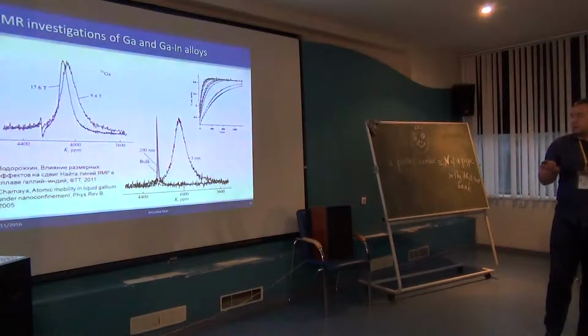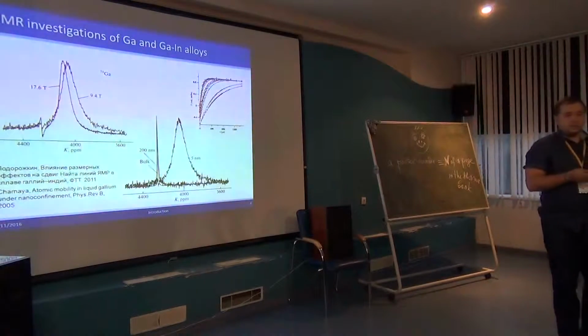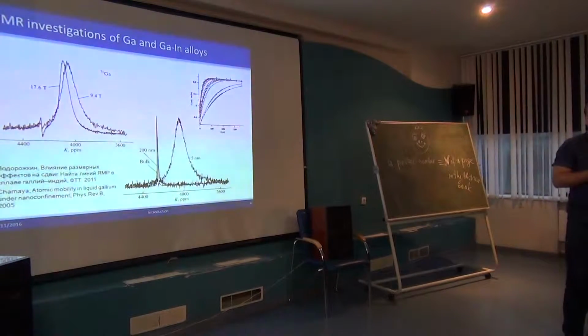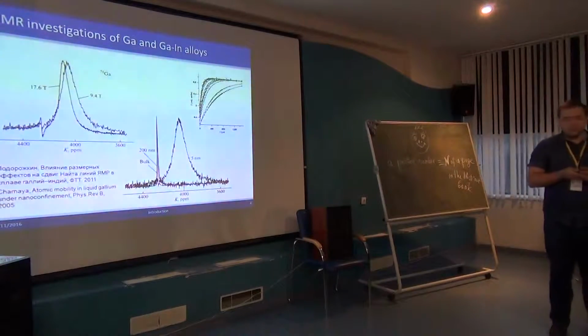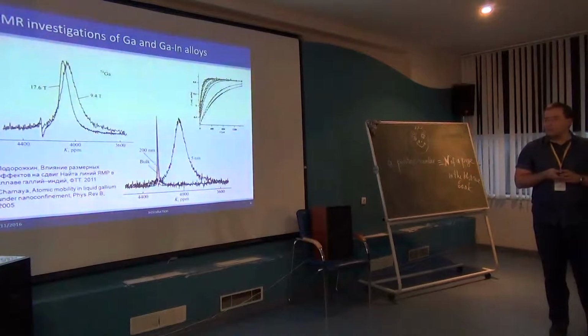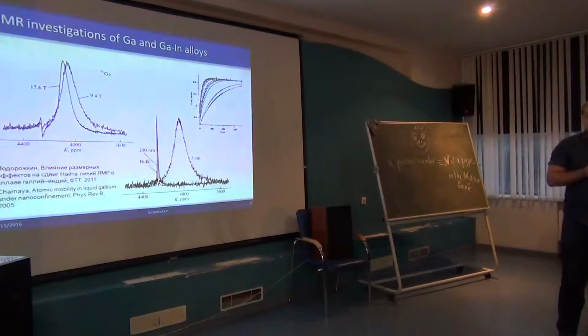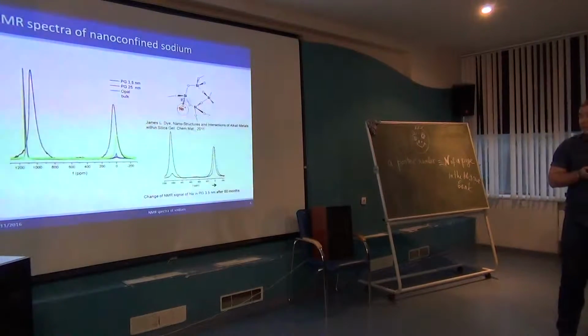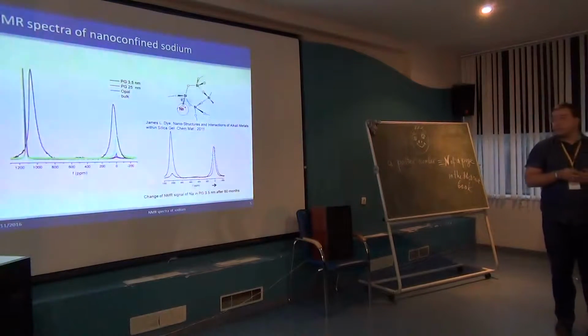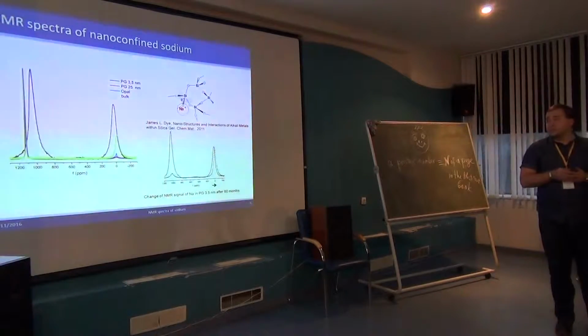This dependence on nano-confinement was explained by existence of quadrupole relaxation mechanism, and it also was proved by experiments with liquid mercury, where there was no strong impact of nano-confinement on magnetization recovery. And now let's turn to NMR spectra of sodium embedded into different porous matrices.